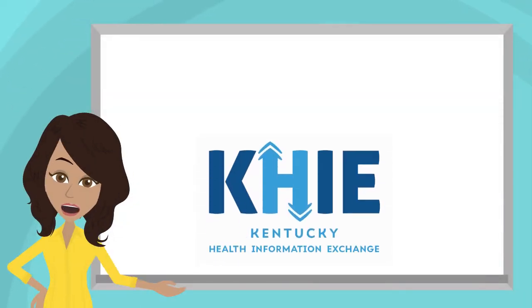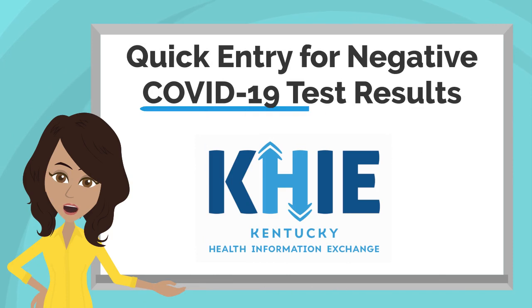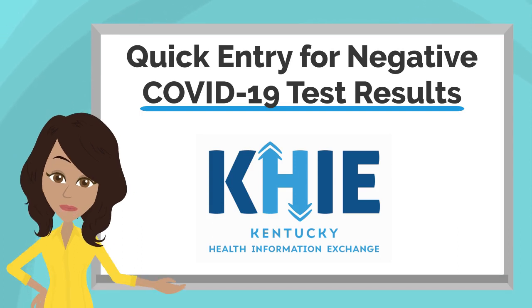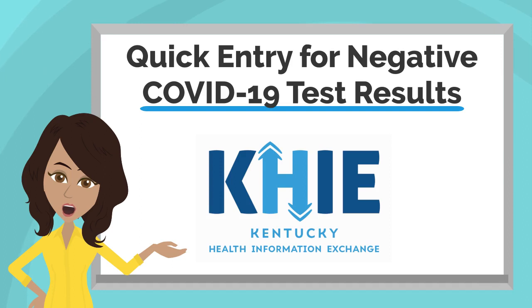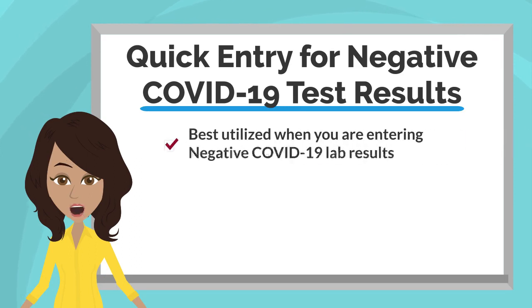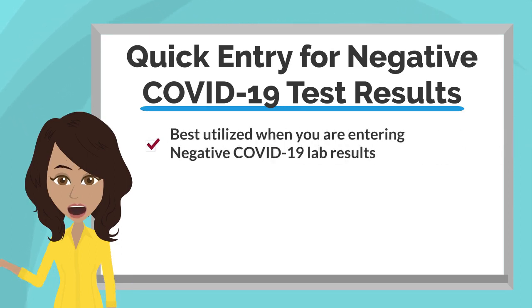This video provides an overview of the Kentucky Health Information Exchange's quick entry for negative COVID-19 test results functionality in the ePartnerViewer. In this video, I will demonstrate how to complete negative COVID-19 lab data entries in the ePartnerViewer. Quick entry for negative COVID-19 test results is best utilized when you are entering negative COVID-19 lab results.